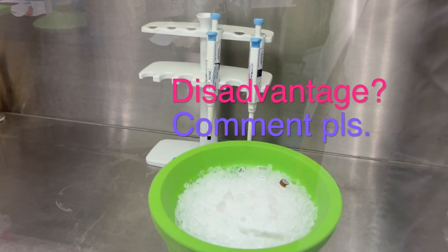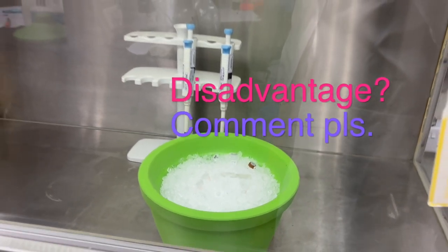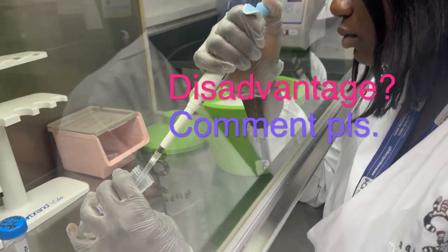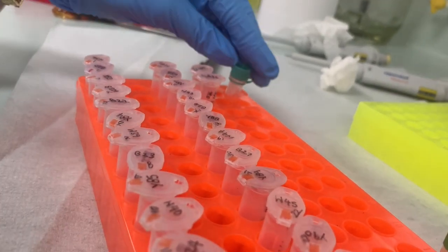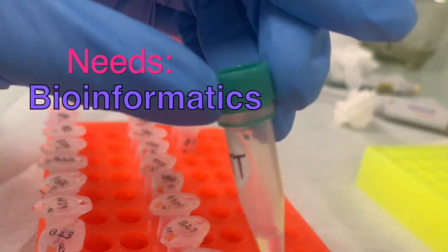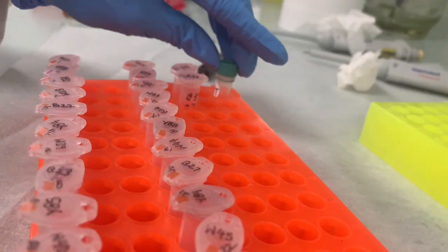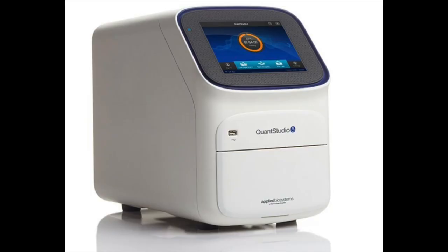So in the previous techniques, the gene is in the form of a probe, and then you hybridize to it. So when you detect it, you know already what you're looking at. But in this setting, you don't know what you're looking at. You're exploring. So the data analysis is not straightforward. It's rather complex. You need good bioinformatic knowledge. Does that make sense? So these are the techniques that you use if you want to study the transcriptome.